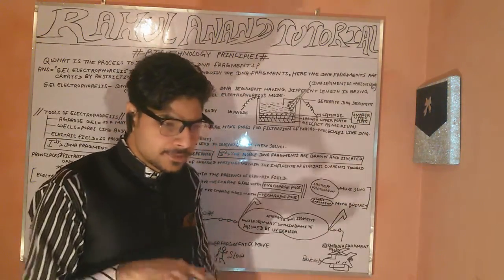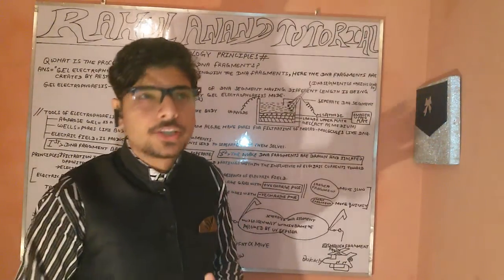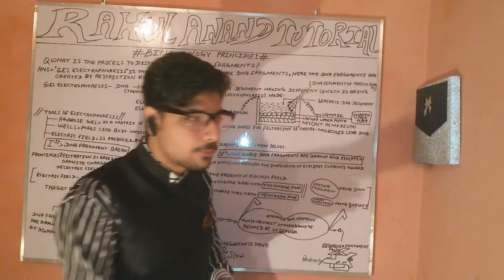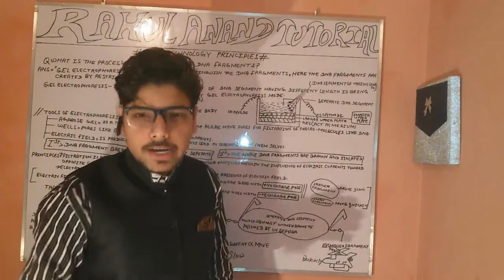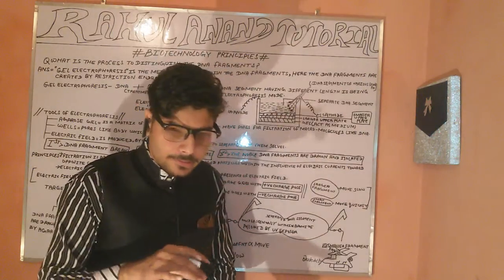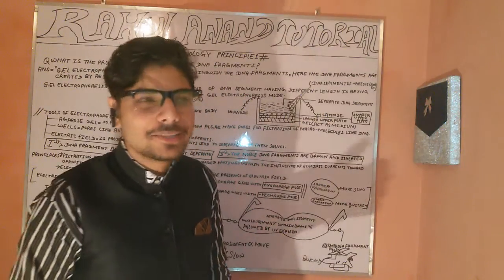In this case, we have certain more things to go into. So DNA as well as the electric field will bear the positive as well as the negative charge. Any kind of attraction plays an important role in the repulsion process as well as the attraction process, to demonstrate the effect within the influence of the electric field. So here we have two facts regarding the electrophoresis method. Our main goal is to distinguish the larger molecules, which are the DNA fragments.